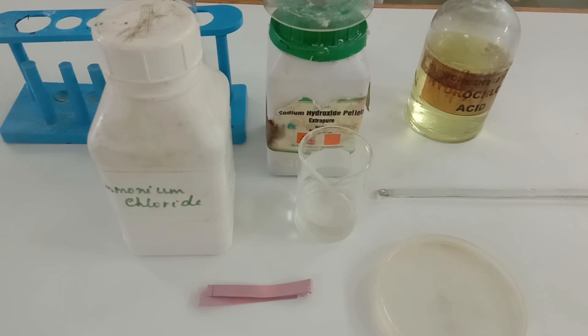We also need to understand the properties of ammonia. Ammonia is basic in nature, that's why I have kept a red litmus paper over here, and I would be demonstrating some of the important properties of ammonia gas too. Here I am going to take ammonium chloride salt.